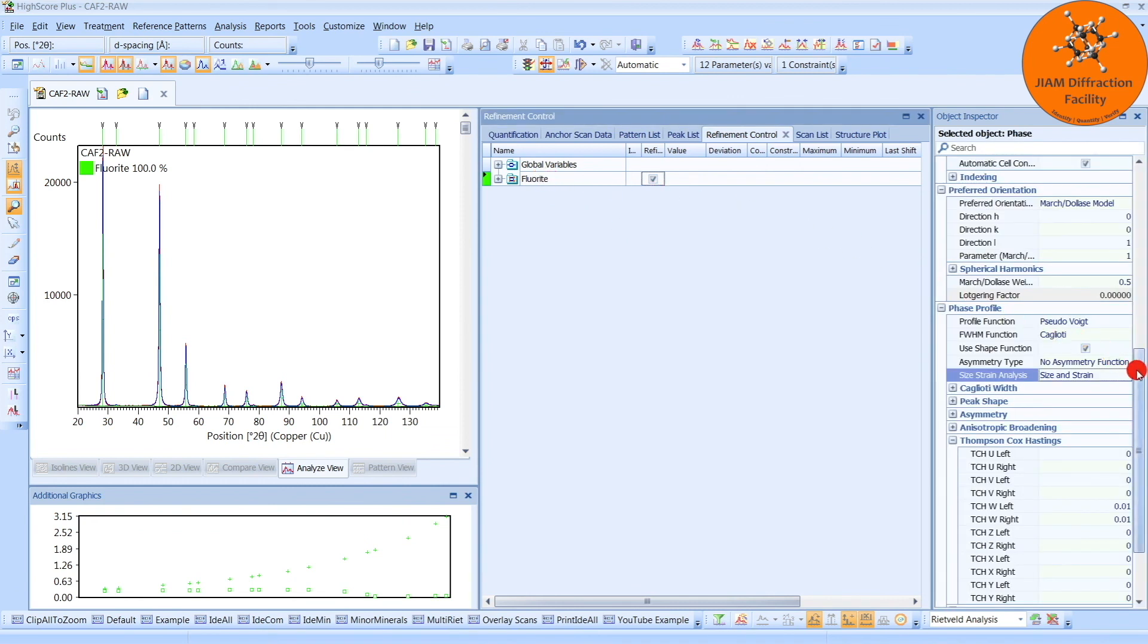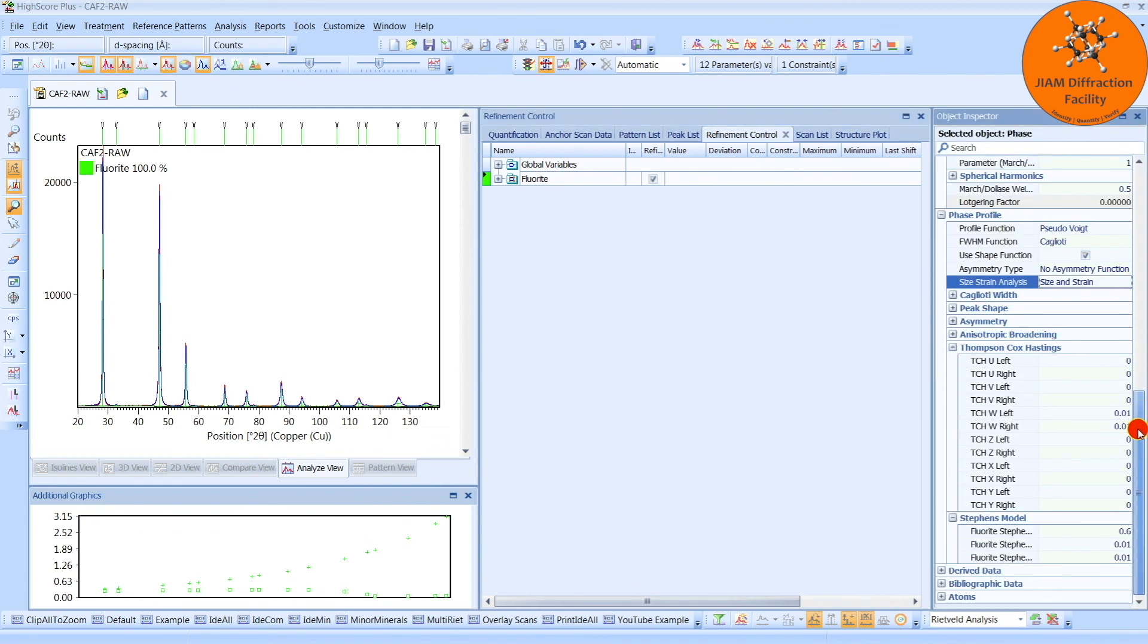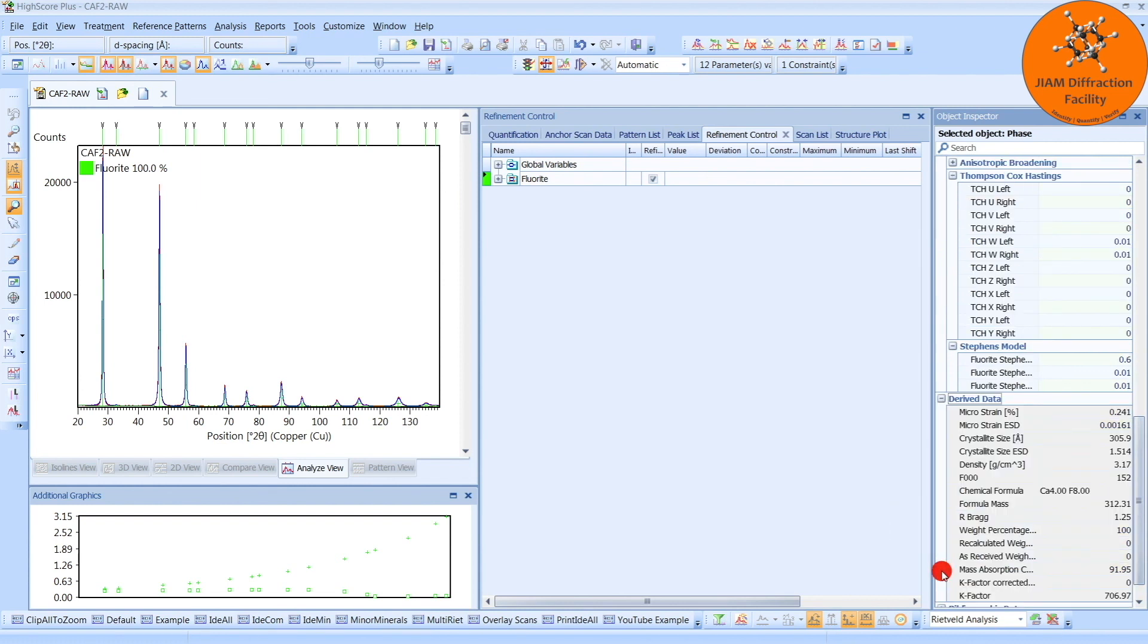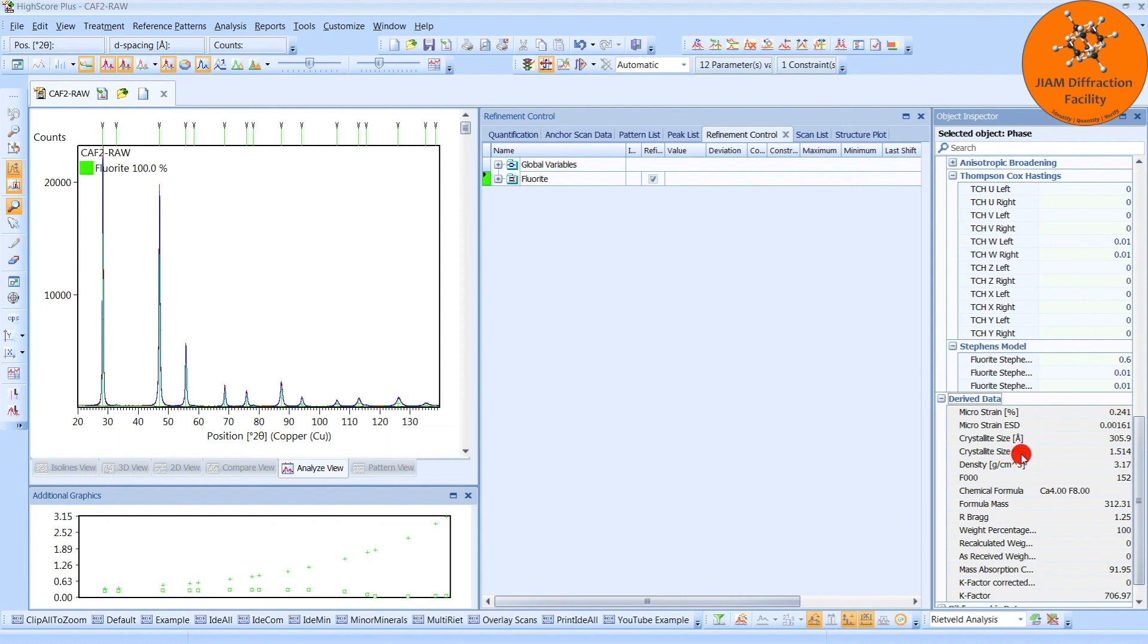And then if we left-click on the phase, and scroll all the way to the bottom, you will see this derived data, click the plus sign, and here we have the MicroStrain in percent, the ESD, Crystallite Size in Angstroms, and then its ESD. So we see here that it is about 306 Angstroms and 0.24% MicroStrain.